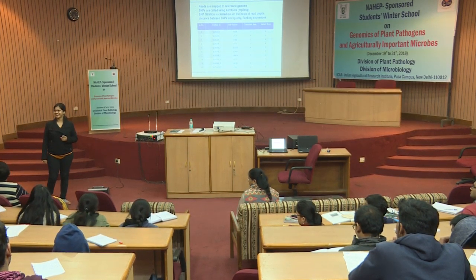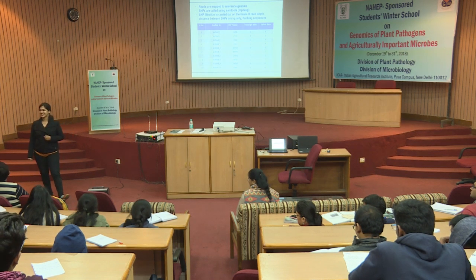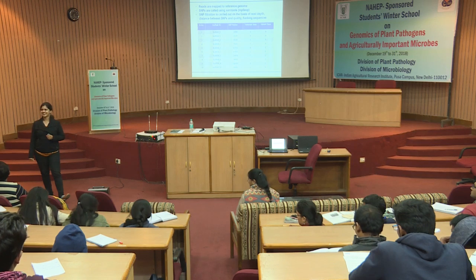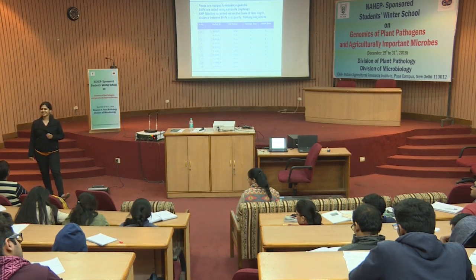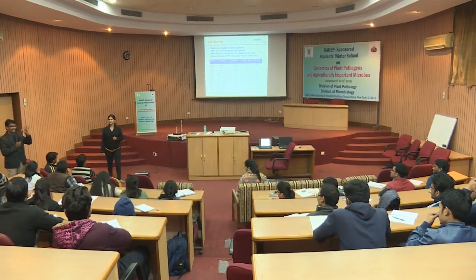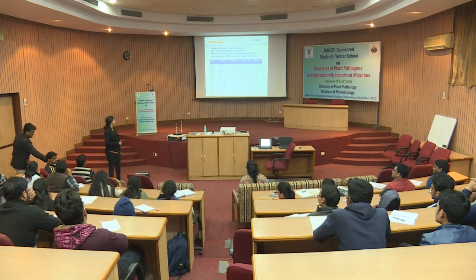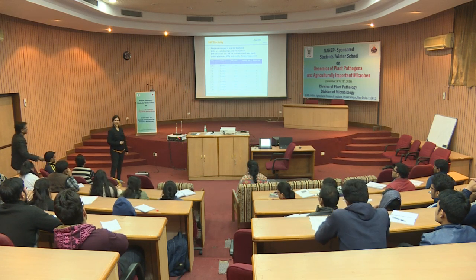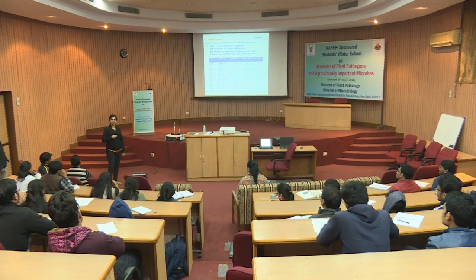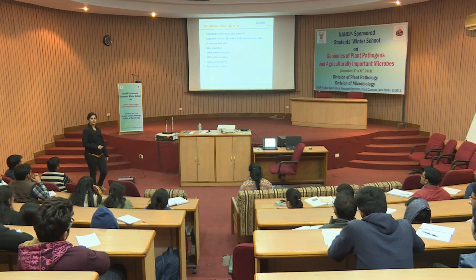Yeah, this point is very important. SNP calling is one of the hot subjects nowadays. So consensus of accuracy: out of 15x, if 14 of them are pointing towards A, they will call A a genuine SNP. Okay, try to get it. So, based on the read numbers which are aligning to that particular region, these SNPs are called. And these are different outcomes.